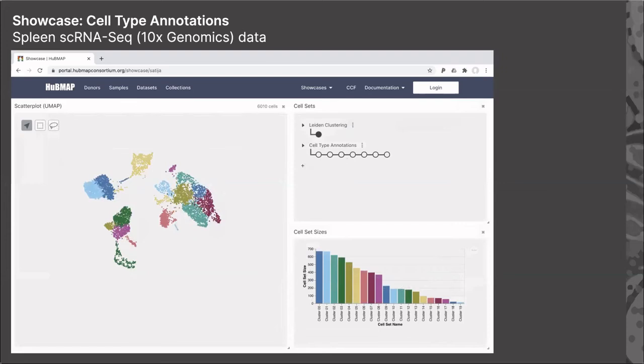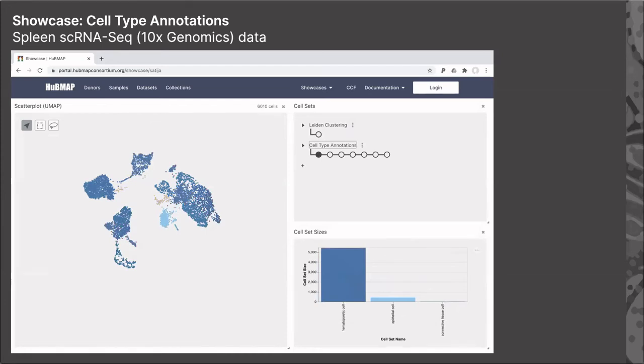So let's zoom in here a little bit, enlarge the viewer, and explore this. When I select these cell type annotations that Rahul Satya's group generated, you see here at the top level, and this is important, this is a hierarchical assignment of cell types. So you see there are hematopoietic cells, there are epithelial cells, and some connective tissue cells. There are hardly any connective tissue cells, a very small cluster. And then we can drill down into that hierarchy to see these assignments with increasing granularity.